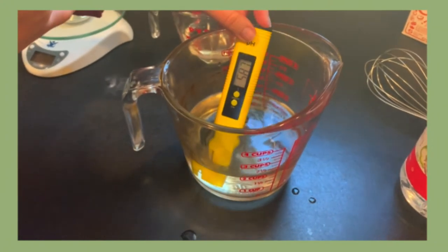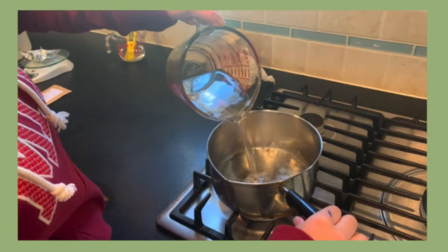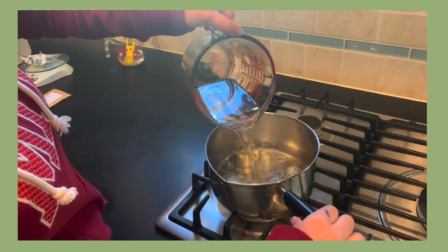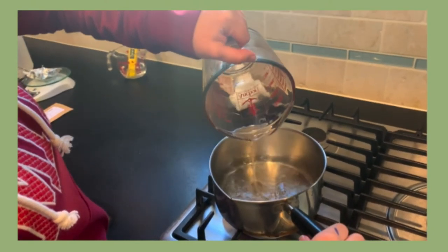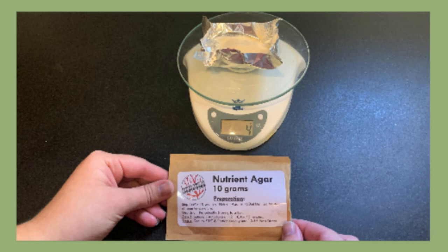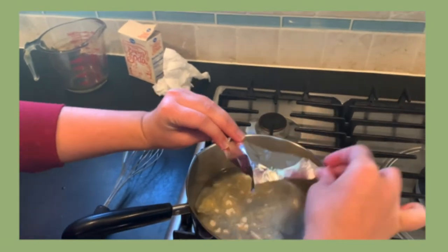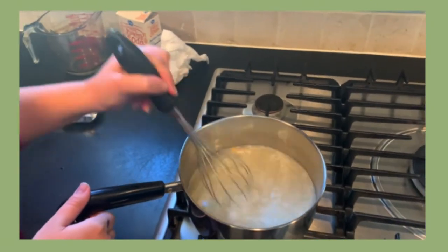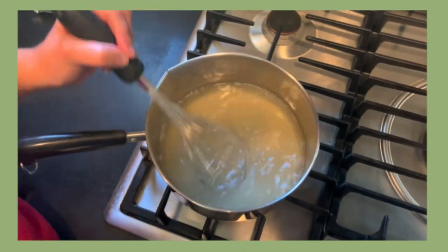Make sure to calibrate the pH meter beforehand. Transfer the liquid mixture to a pot on the stove and heat lightly. Measure 4 grams of nutrient agar using a weigh boat and a kitchen scale. Add the agar to the mixture and mix until fully incorporated. The mixture should be a clear, pale yellow color.